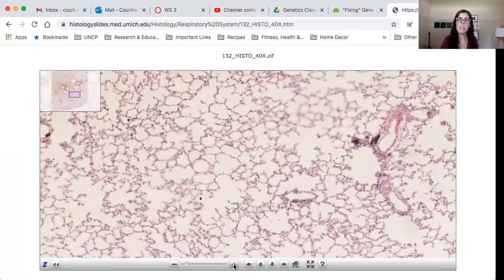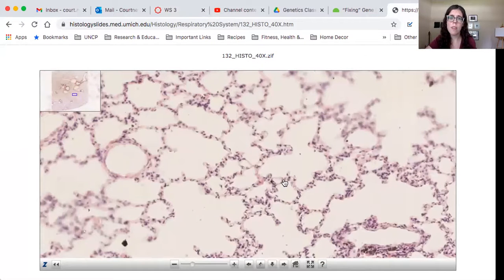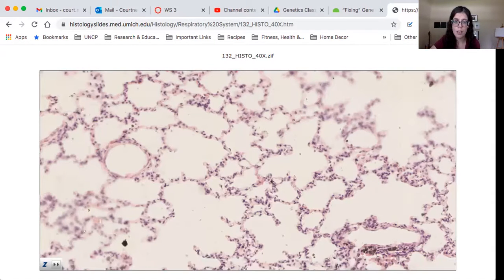Again, in order to determine the tissue type, we kind of have to look at the structure of the cells and how they all work together. So we're looking at here, it looks like to me, a thin layer of thin cells. I wonder what kind of tissue type that might be, these thin cells. Okay, so you want to take a screenshot. And again, you want to think about why the cells here are one layer of thin cells. How does that relate to the function, what needs to occur in this tissue?